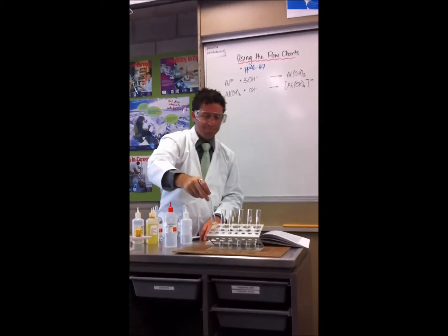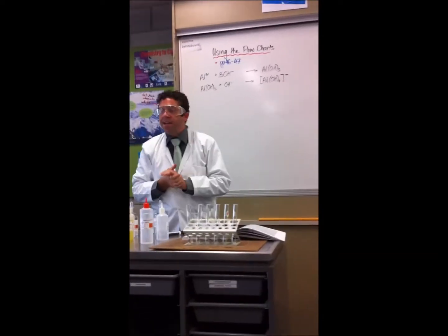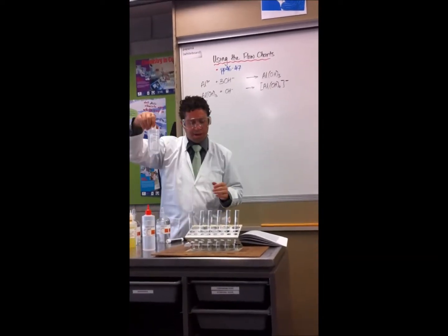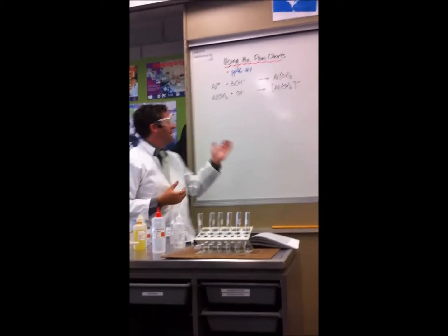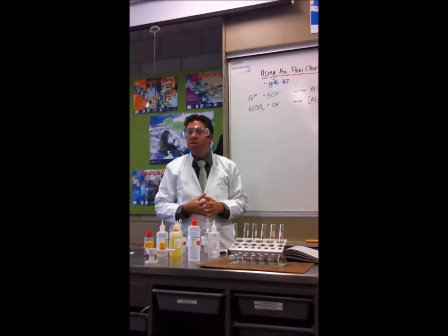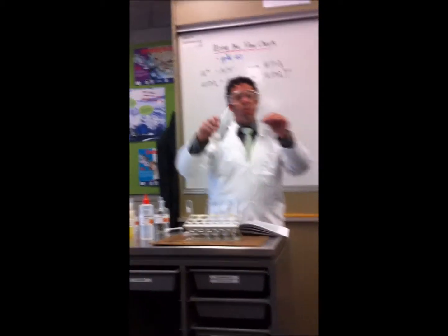It's mainly water. I still don't know it's aluminium though. I still wouldn't know it's aluminium if I didn't know which one it is. It could be aluminium, or it could be lead, or it could be zinc, because all of those make these complex ions. They all do it. So now what I need to do is get a new sample, and remember, just a small amount.